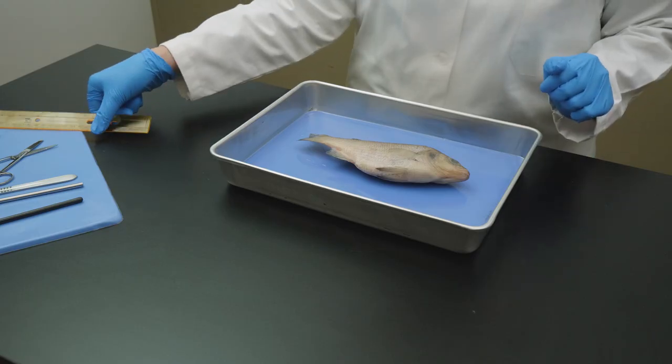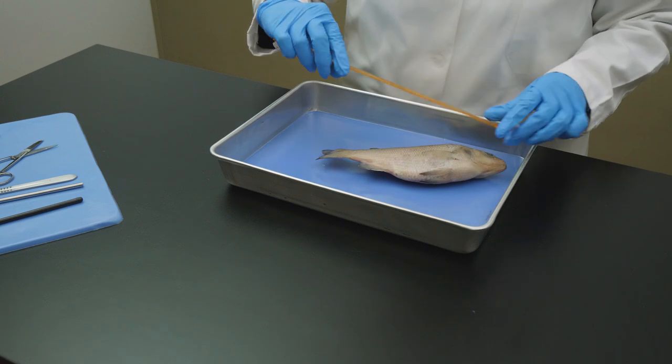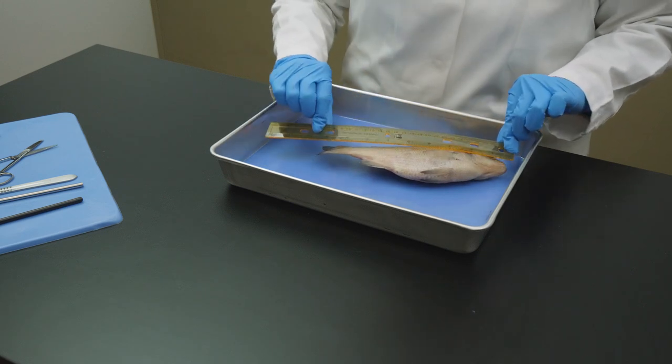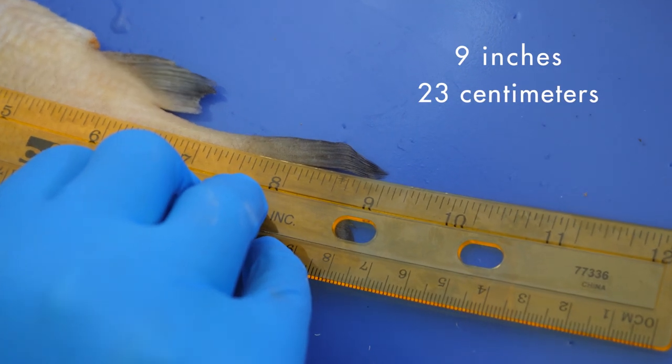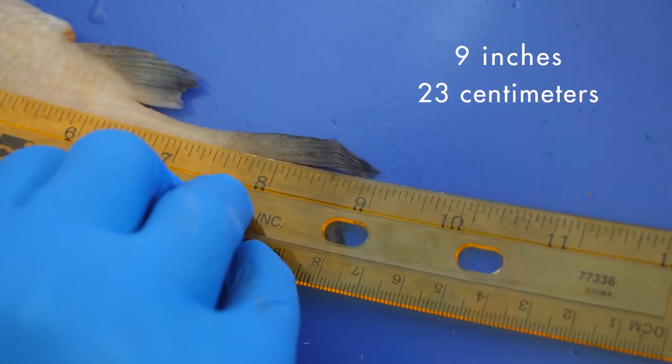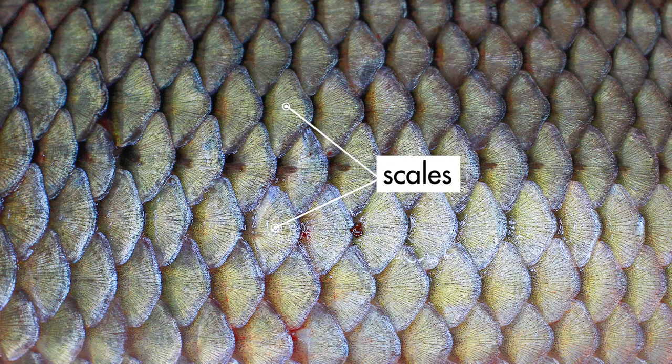Let's measure our perch to see how long it is. From the front of its mouth to the tip of its tail, this perch is about 9 inches, or 23 centimeters long. Therefore, we can assume this is an adult perch. Many bony fish, such as this perch, have tiny overlapping scales covering their bodies.